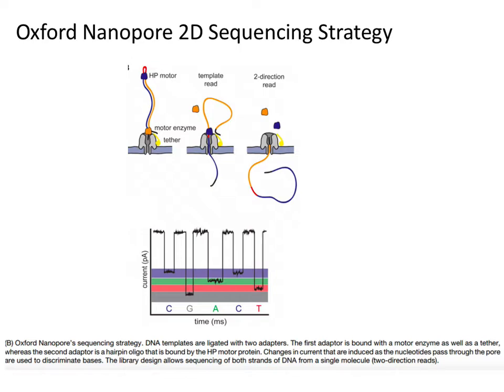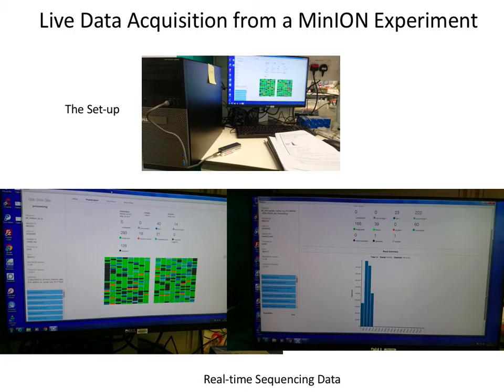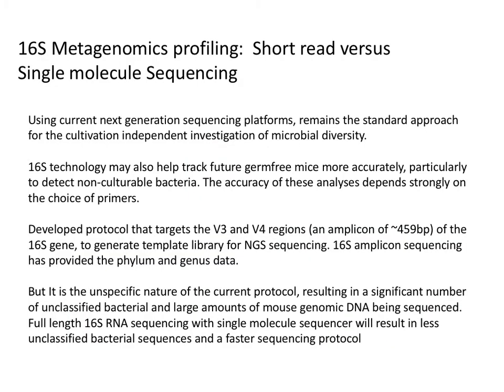So it's like paired end in a way. If you think of paired end, it's that kind of paired end because it's got 2 pieces of information for the one piece of DNA. Okay. Setup, very simple. This is a setup I had at the Crick. Data comes live. The green that you see tells you pores that are active, black ones are not, and then you'll see this changing as you go. It keeps recording, and this is live information. It tells you how many reads you've collected, what the read length is, and those are all done in real time as you're doing the analysis.